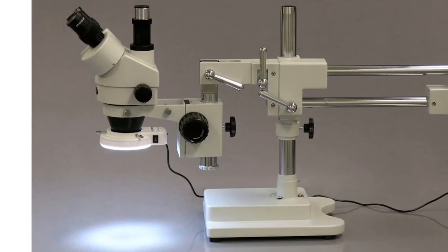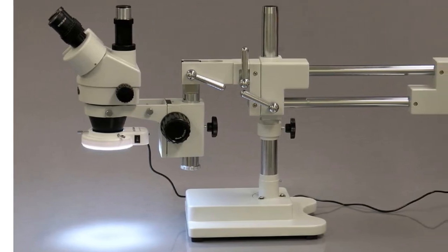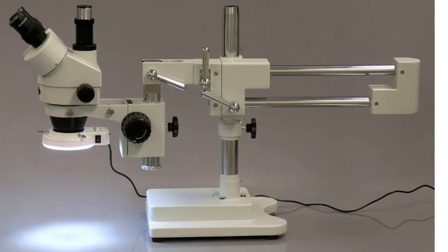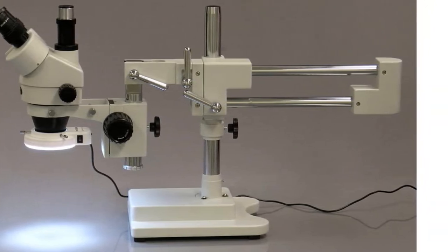What customers are saying: excellent for electronics prototyping and repair. There is plenty of space beneath the objective lens to work on boards. Very pleased with it because you can move it into optimal position with ease, and the optics are great.